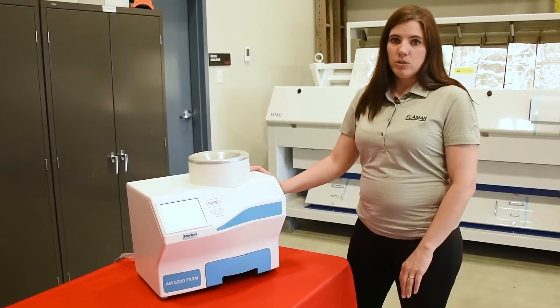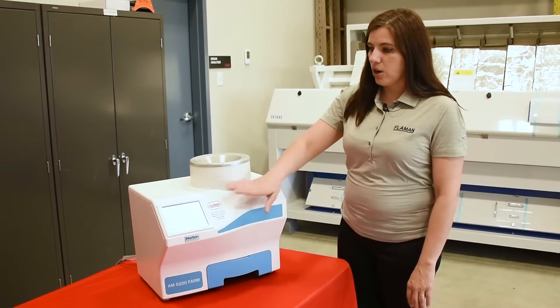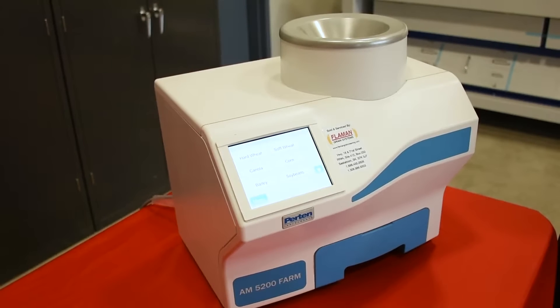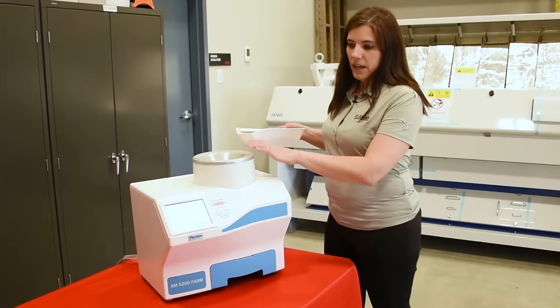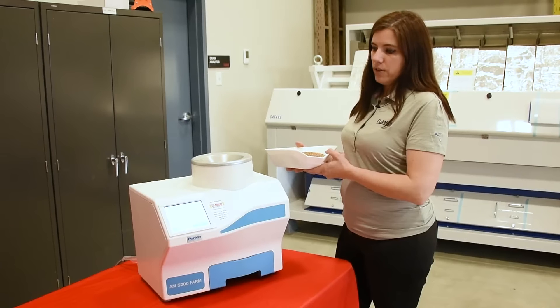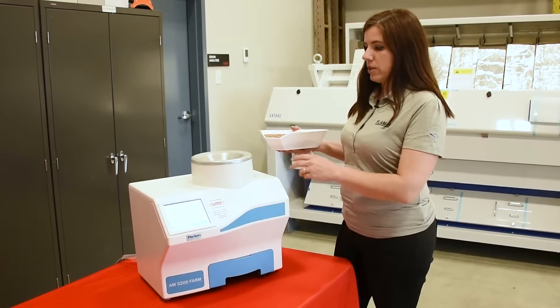It's a very easy to use machine. All the grains are listed on the machine — the grains that are programmed in — and you just select the grain that you're going to test. You just need to pour the sample in the top and the machine will do any kind of adjustments and measurements for that grain.